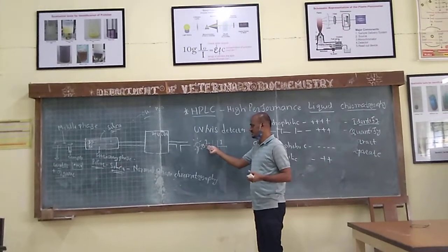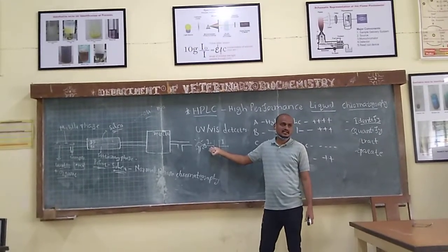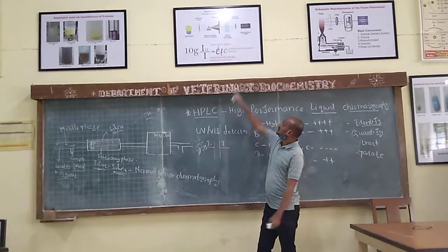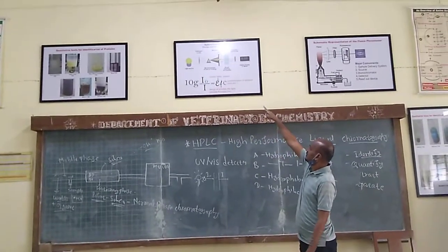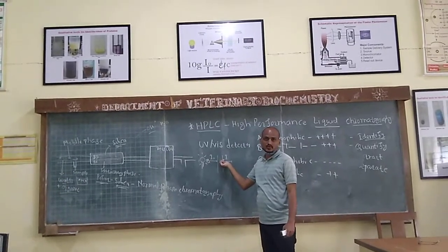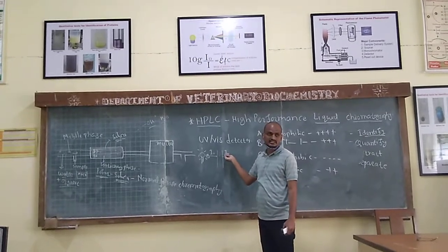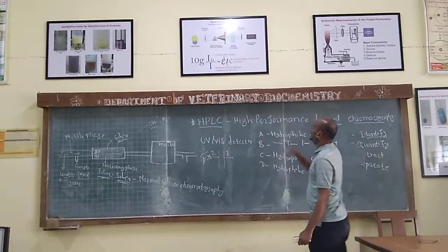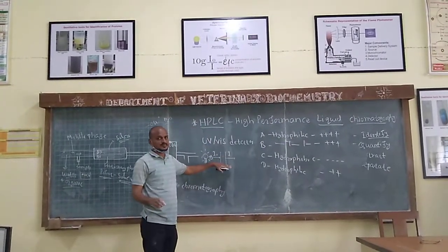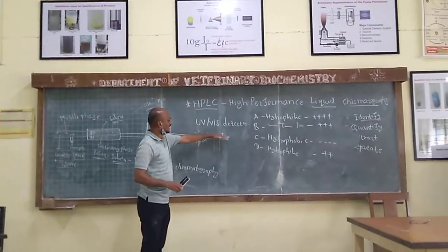Now the wavelength of light we have selected is, for example, red in color, or a different color: violet, indigo, blue, green, like that, right? Based on its wavelength, you can see this light is splitting. So suppose this is yellow light, it is passing through this molecule. Now this is the incident light, and this is the transmitted light. So this is a sample cuvette. This is the principle of the spectrophotometer, right? Already we have seen the spectrophotometer principle. So I0 light is there.